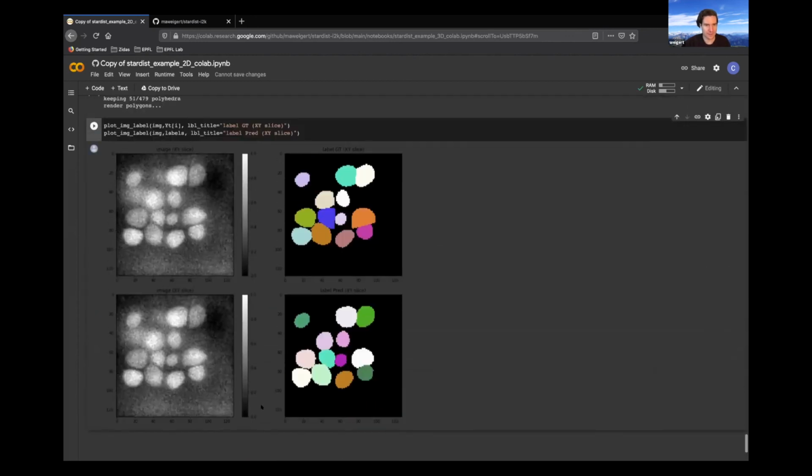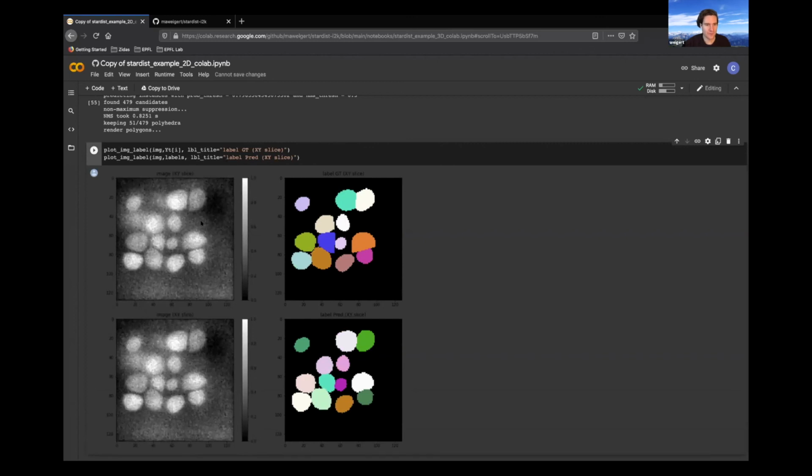And yes, if you see, there are all those hard cases that are not star convex. In general, it finds most of the nuclei, right? And you see these labels were annotated in a way that contained a lot of hard edges. Those hard edges are hard to reconstruct with 96 rays. So those hard edges will actually be star convexified, right? This is an effect that you see if you have crazy shapes: it will predict the most star convex shape according to that.